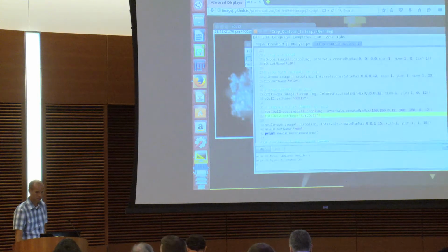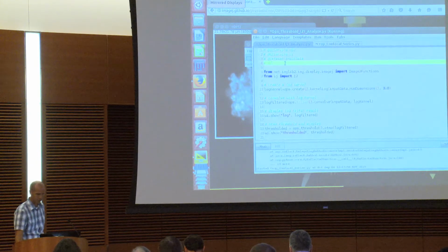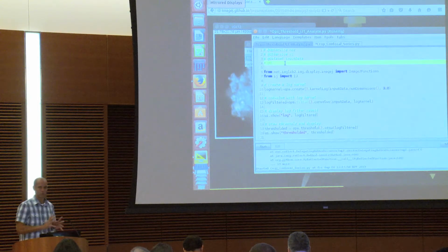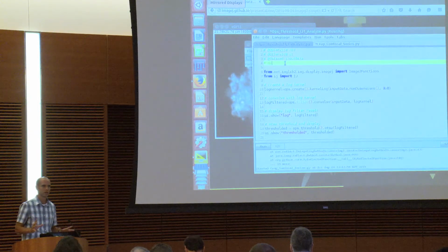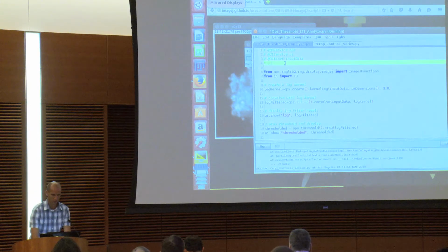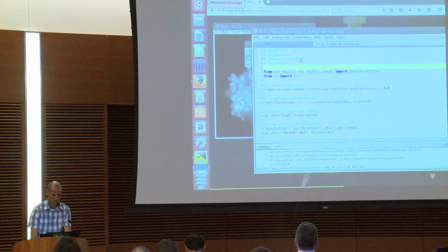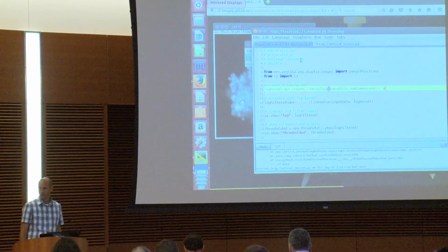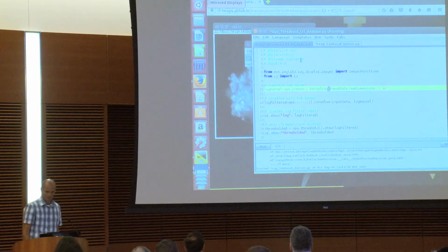And then we go back to the ops threshold, IJ1 analyze. What we're trying to accomplish here is to add a new parameter that's going to define the sigma of the filter. So we can go at double sigma, or let me just call it S for conciseness. And we are going to put an S in here.